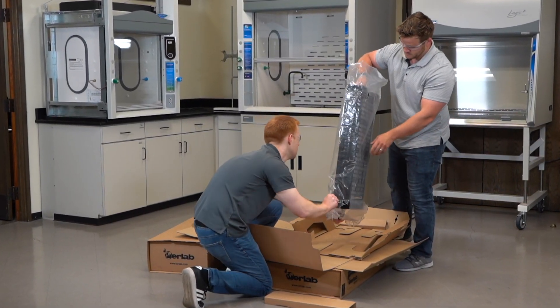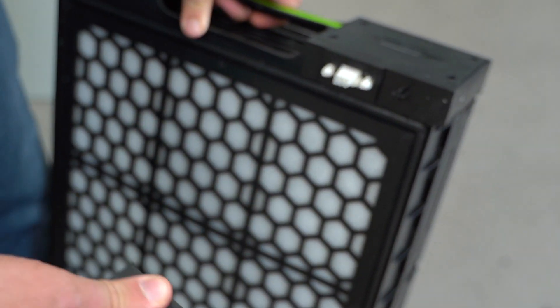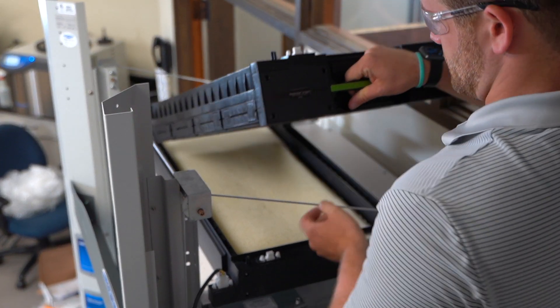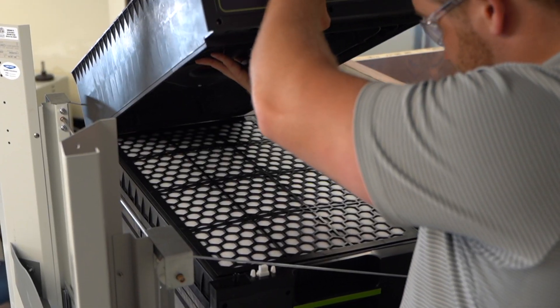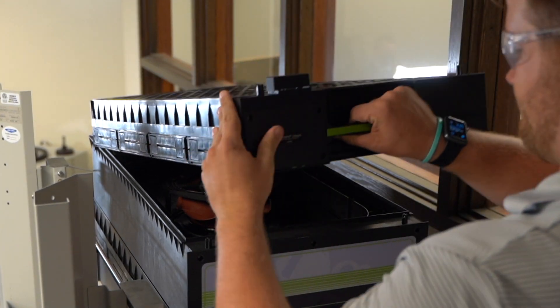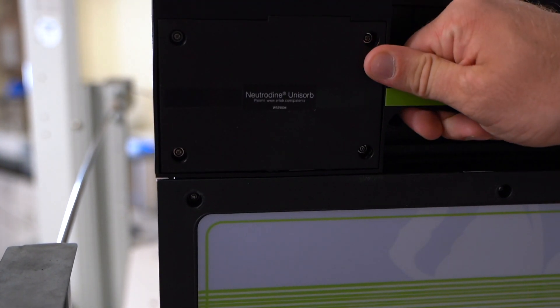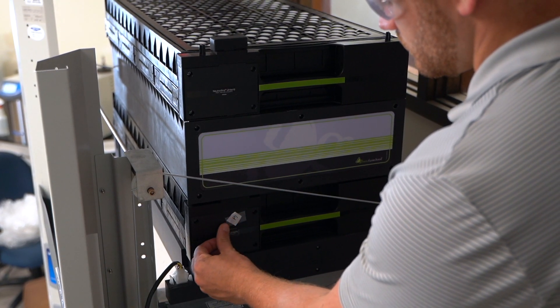Unbox the ventilation components, which include Neutradyne filters by Erlab. Arrange the filters and ventilation components in order: the primary Neutradyne filter, then the fan box, and then the secondary Neutradyne filter. Label the filters as primary or secondary using the provided stickers.